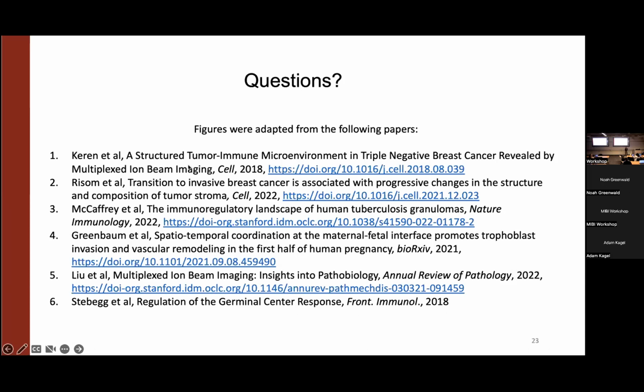And you've brought up some ideas before about how you could maybe do something similar without having to specify a threshold. Yeah, it's not implemented in this pipeline, but you can also think about distances themselves, without thresholding and saying close interaction, not a close interaction, which will in some cases be sensitive to that threshold. I mean, you would hope that for the most part it will be robust and you can test around it, but for some instances, yeah, it will be sensitive to the threshold. And then you might want to look at the distribution of actual distances instead of just counting occurrences, was close, was not close, but create a null distribution of distances from that feature.